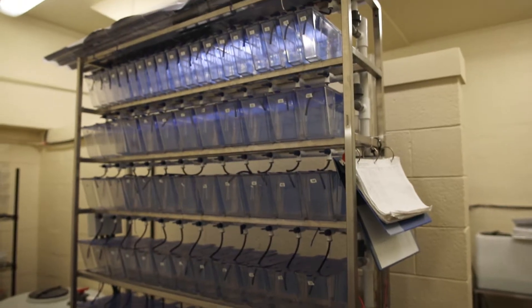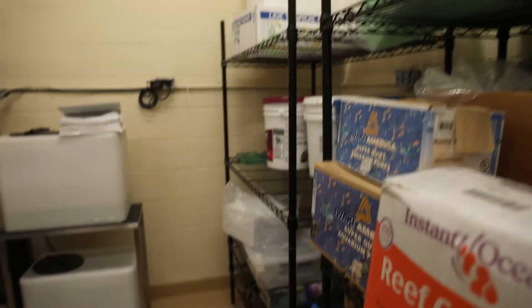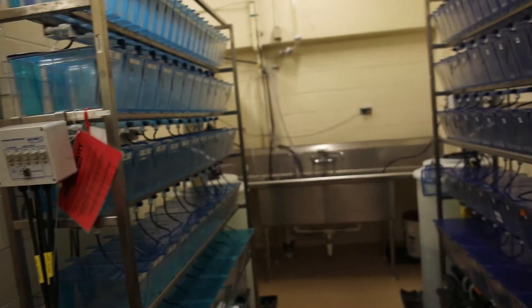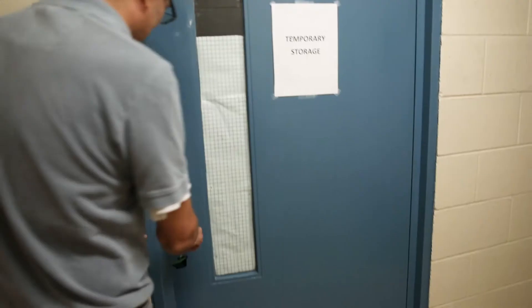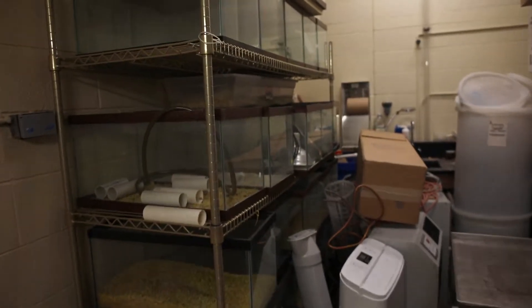Finally, the facility also has a quarantine room with three standalone racks, and at this moment only one is running with about 20 fish in quarantine. This is where we receive new lines from other labs or facilities. The facility also has an independent storage room where we keep replacement parts and all facility components.